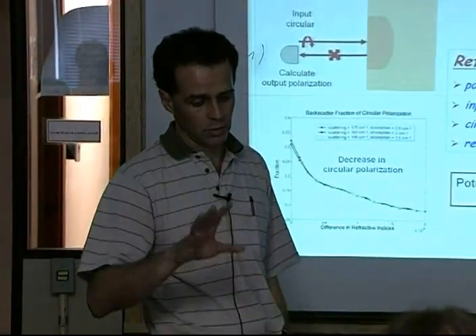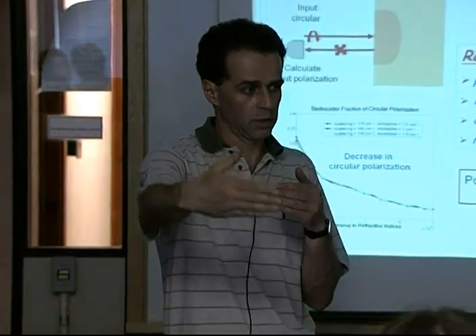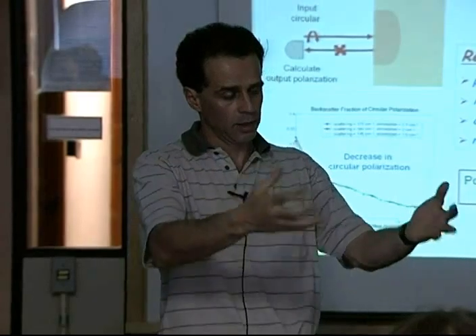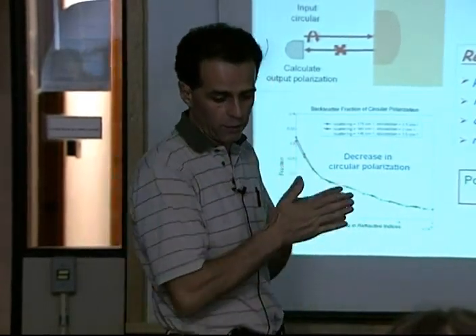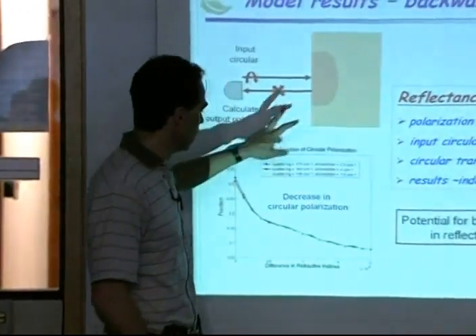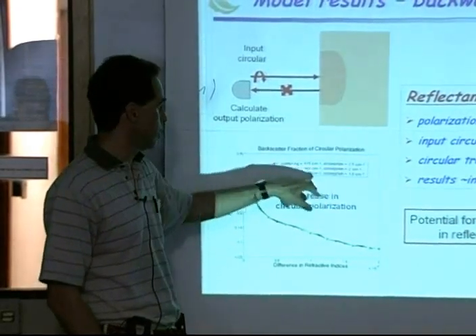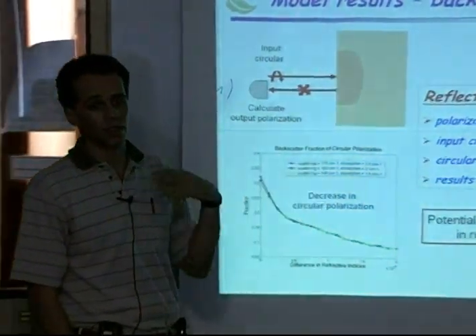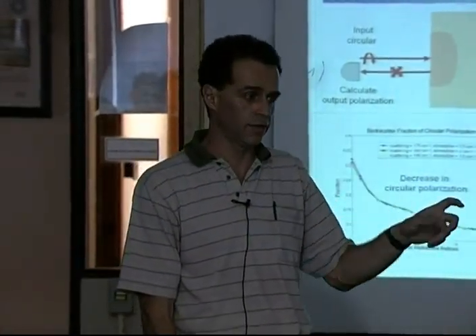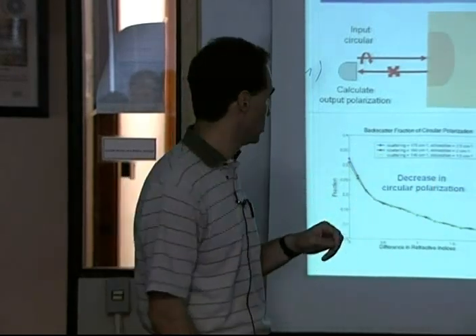What we've also done is in vivo. We're not going to be measuring through thin sections in the forward direction. We're going to be measuring in the backwards direction, most likely. Not necessarily at 180, but somewhere in the backward sphere. So we've done a lot of simulations and some initial experiments in the reflectance geometry. And one of the nice things we found is that the results we're getting are almost independent of the tissue properties, which in general we don't know.